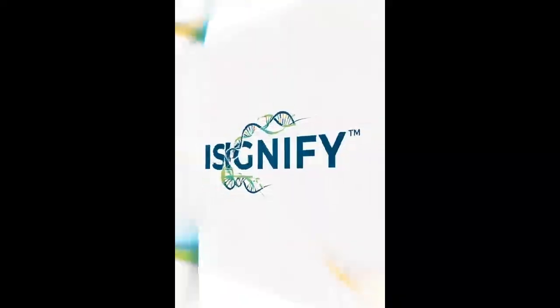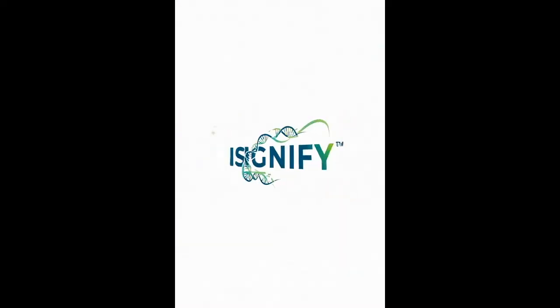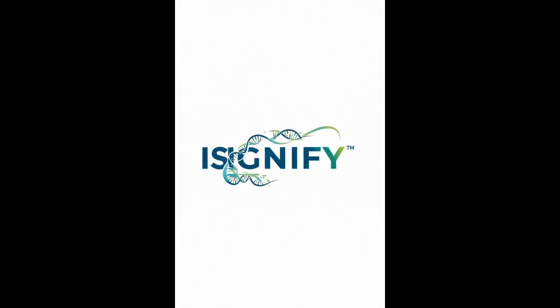With iSignify and Gemma, we made microbial fingerprinting fast, local, and accessible. This is what science looks like when it's in everyone's hands. iSignify, built for the Gemma 3N Impact Challenge.